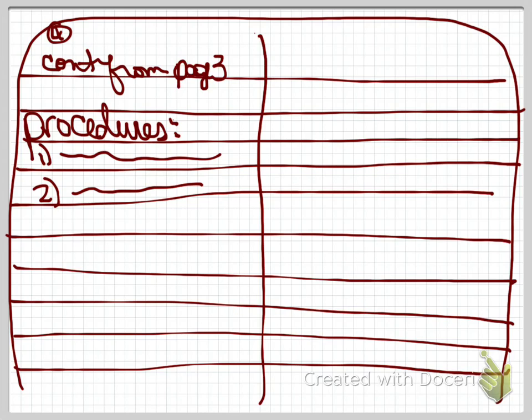And I'm going to be checking, or Mr. Mahar is going to be checking, on making sure that you use very good descriptive words. I specifically asked you in this lab notebook to write 3 good properties of your known metal. Was it shiny? Is it hard? What shape is it? Give some very good descriptions of your knowns and your unknowns for that matter in this lab. And write them. Don't just say, oh, it was gray. Well, what color gray? Dark gray, dull gray, shiny? Was it soft? Could you smush it?